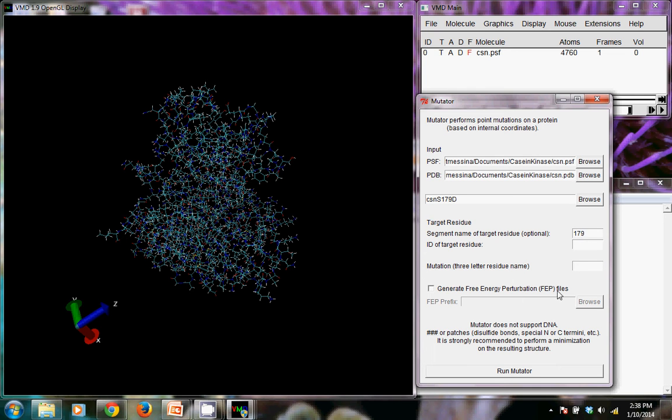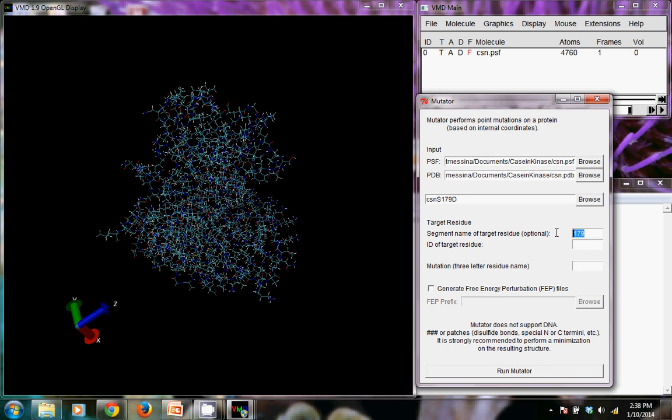That's 179. We actually don't need that. That's an optional input there. The target ID is the 179. That's the residue that we're trying to mutate.